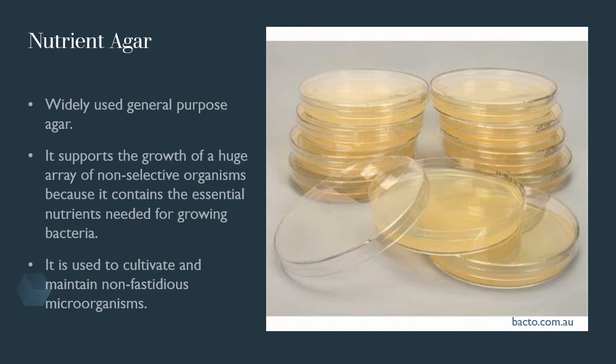So it is used to cultivate and maintain non-fastidious microorganisms. Fastidious means the microbes which require a particular ingredient to grow. Without that particular ingredient the microbe cannot grow. Those microbes are known as fastidious microbes. So nutrient agar supports the growth of non-fastidious microbes.